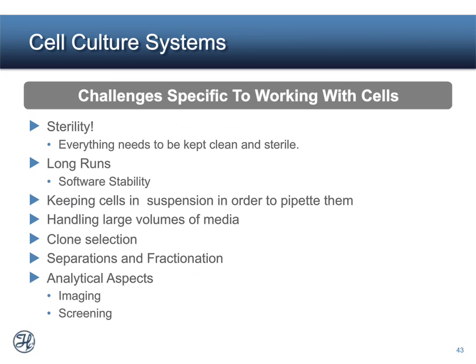Also, keeping your cells in suspension in order to pipette them if you have suspension cells. As we all know, cells tend to settle over time, so that's another challenge that you have to overcome on an automated system, and looking for the right tools to do that job is important.